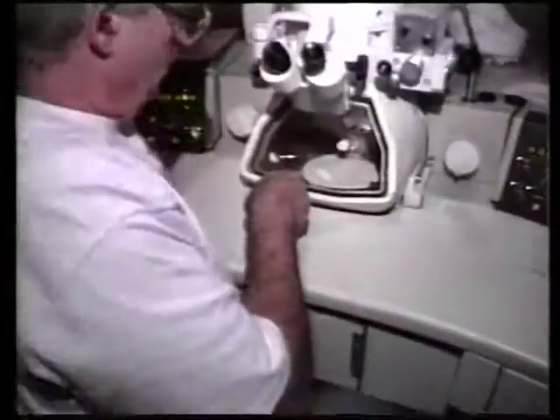Is it coming up? The grid is just appearing. We haven't been working on it that long, but what we found is the shellfish that have died, we've ground those up, and what we found is a large number of virus particles in there. Very, very small, roundish particles, spherical particles. They look very much like a soccer ball. And there are so many of those particles, we're pretty sure that that's what's causing the deaths of these shellfish.